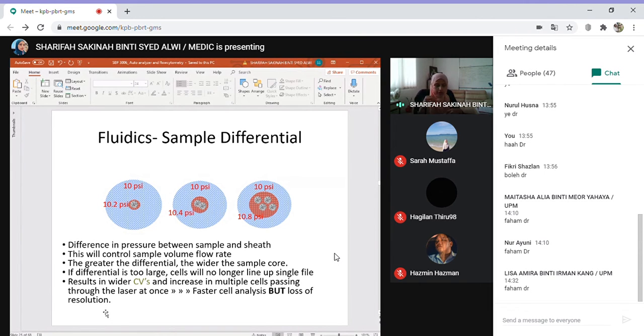For example, usually the amount of cells that we prepare to be sucked into the flow cytometer is 100,000, a lot, especially if the cells are of the PBMC type, which are usually non-adherent cells that are small. For non-adherent cells we usually acquire more, up to 100,000 for example, or up to 50,000. When that happens, usually it will take time.